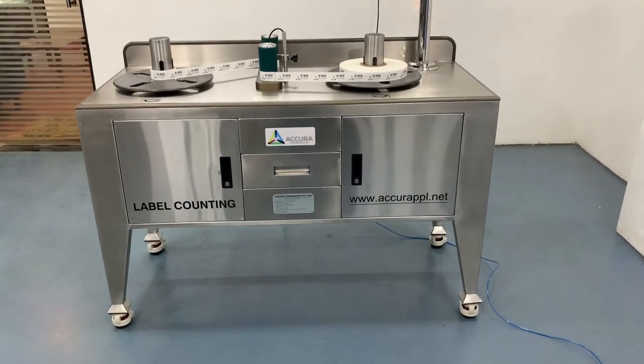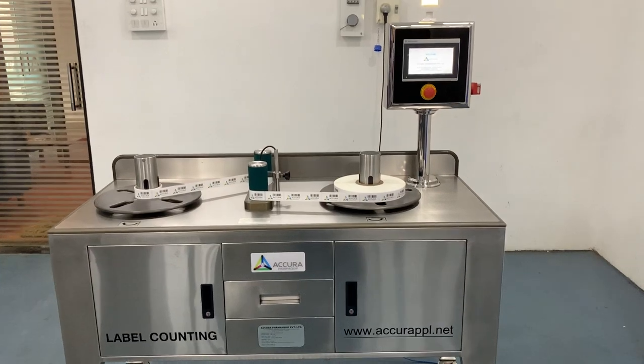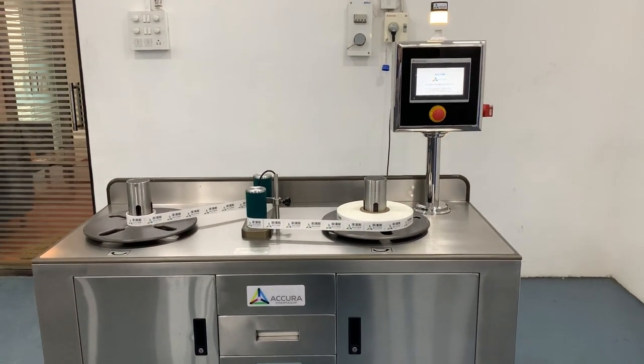The Roll Label Counting Machine, manufactured and presented by Accura Pharmaquip Private Limited.